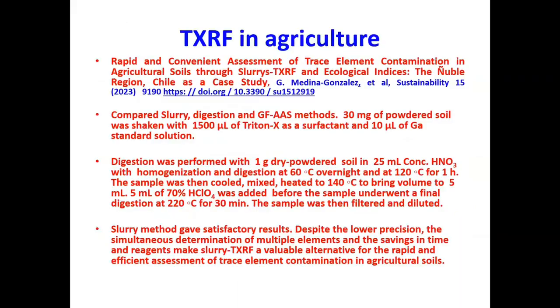Similarly, the analysis of agriculture products, agriculture soils, and fertilizers is also a very important area. Here a lot of samples are required to be analyzed, and TXRF can serve as a fast multi-elemental analytical technique. Some reports I came across: one is by G. Medina Gonzalez, in the journal Sustainability, published just in the year 2023.